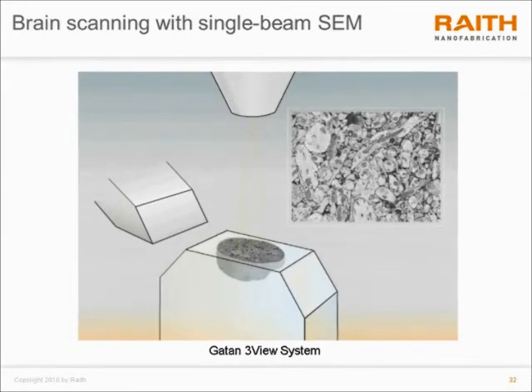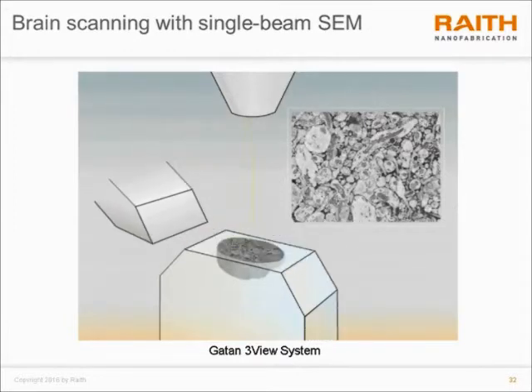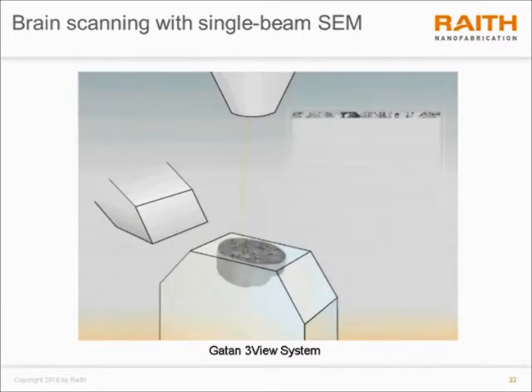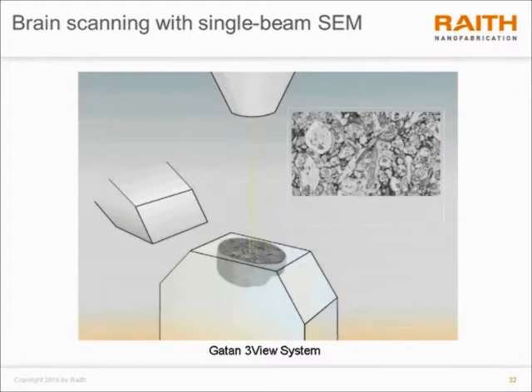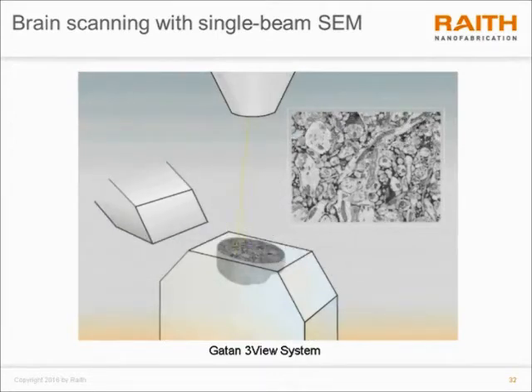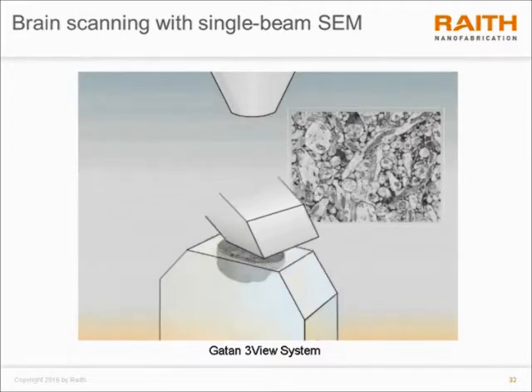over volumes with dimensions of about 1 millimeter or even up to 10 millimeters, which is what neuroscientists desire for capturing the essential structure of neural circuits. Now, this will not be an approach for mapping the connectome of the entire human brain. Certainly, this is a very slow process, but still, the ability to do this at the scale of 1 millimeter and 10 millimeters is very important already, and can show very important information for neuroscientists.